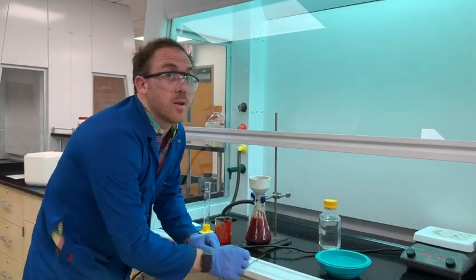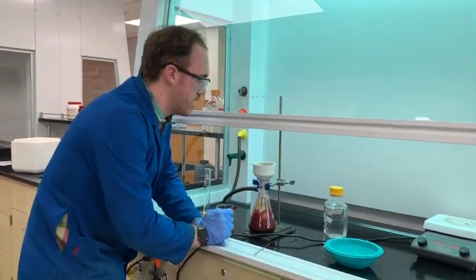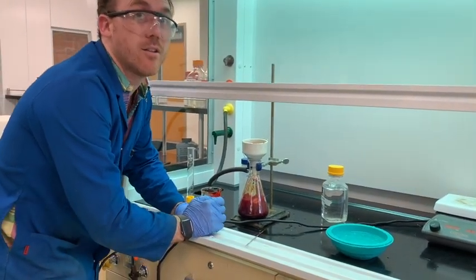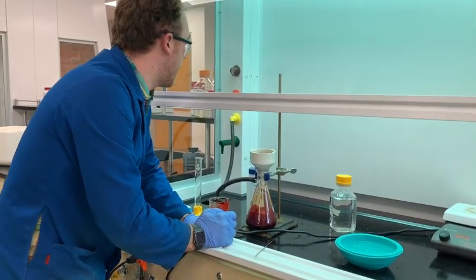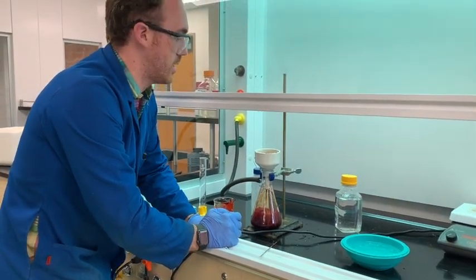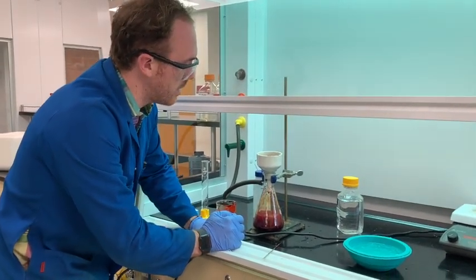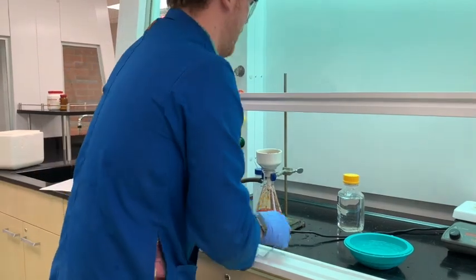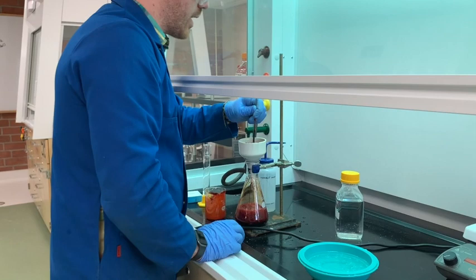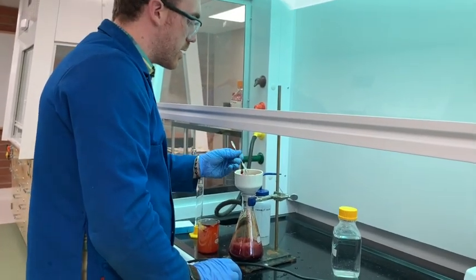Now it's good to make sure that you keep an eye on the filtrate, just to make sure that it doesn't get up into the vacuum line. Otherwise, you could make your lab manager very, very angry. It's not a very easy thing to clean up. And it definitely is not going to come out if it gets anywhere other than into the waste container. It's a dye. It's a very concentrated pigment, and it will color that thing forever. So, luckily, if you're trying to use it as a dye, it's good at its job. It's definitely good at staining things.